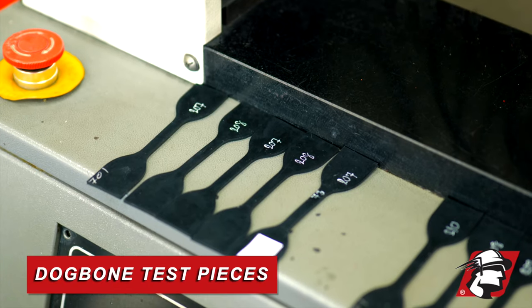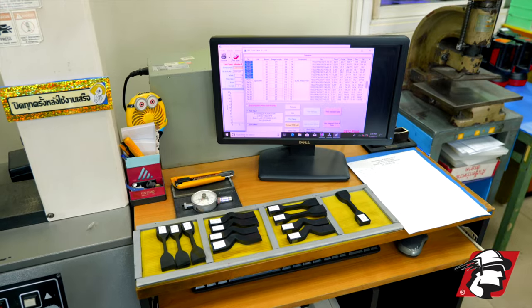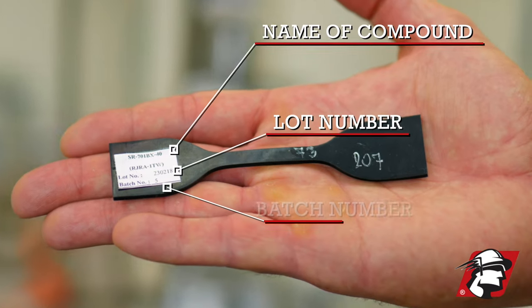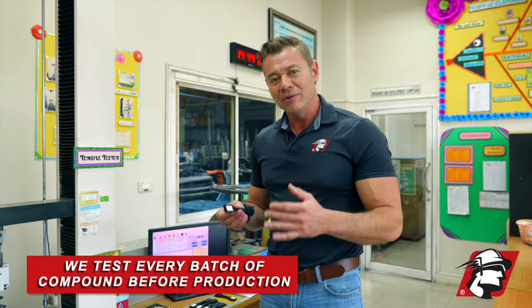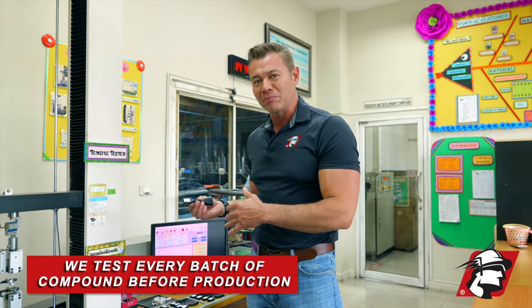These are test pieces from a rubber compound that we've mixed. On each one of these samples it will have the name of the compound, the lot number, and the batch number. So every batch that we're mixing, we're able to test the compound before we actually put it into the manufacturing process.